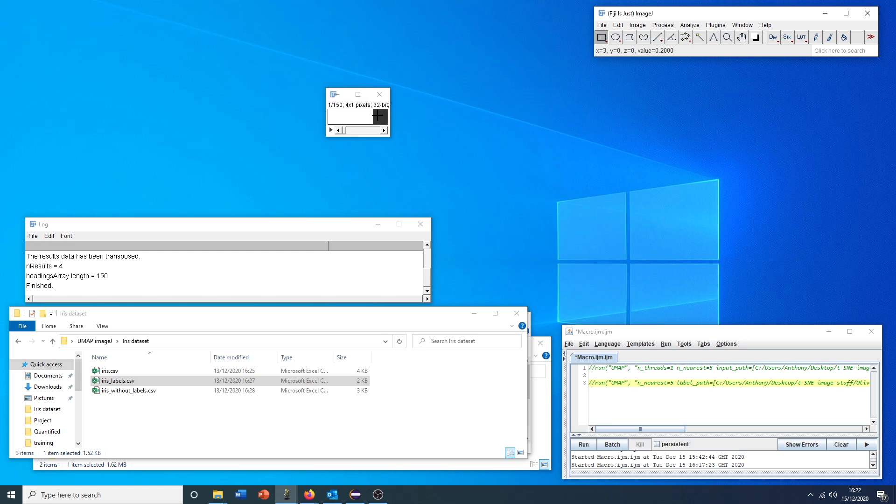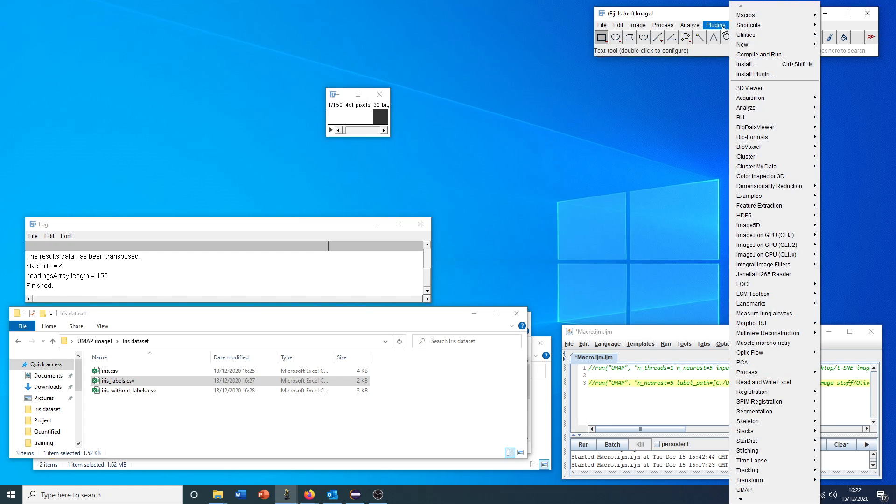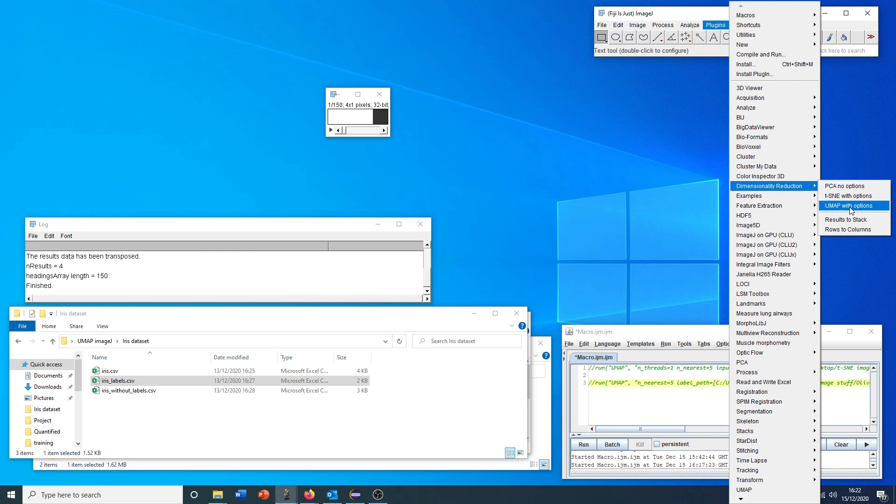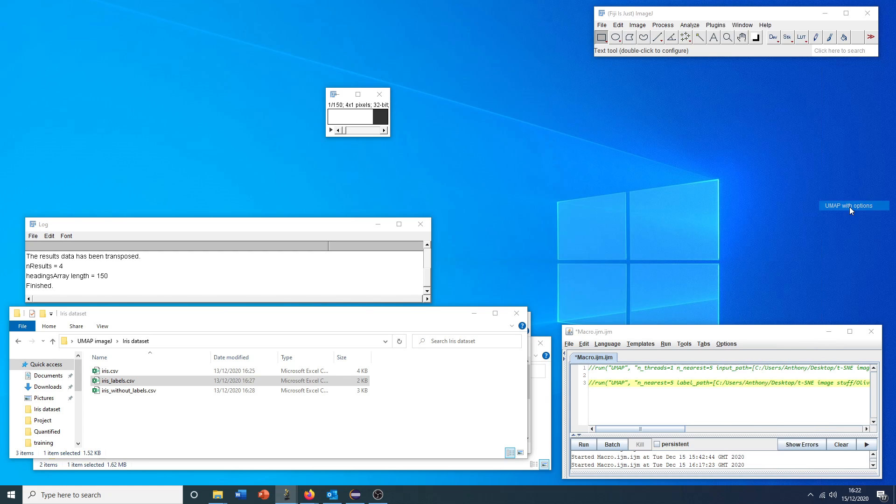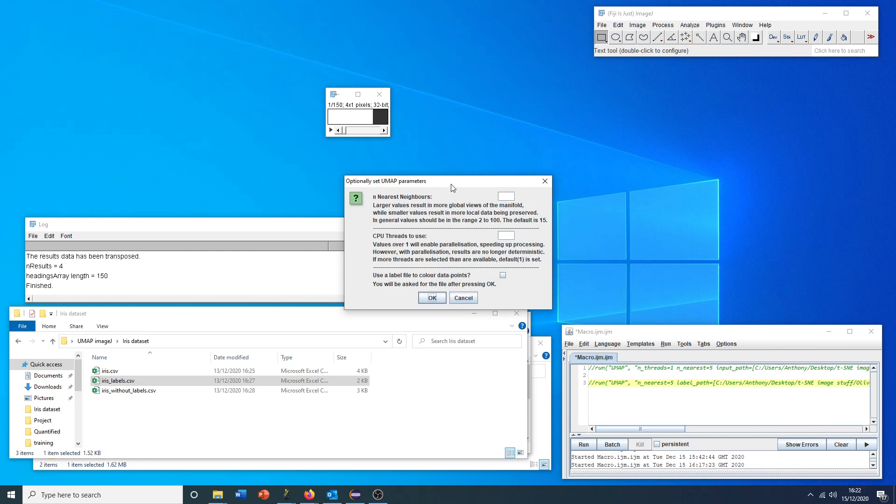With this stack open, we can now go to plugins, dimensionality reduction. Again, pick any tool we want, but for consistency sake, for this tutorial, we'll stick with UMAP.